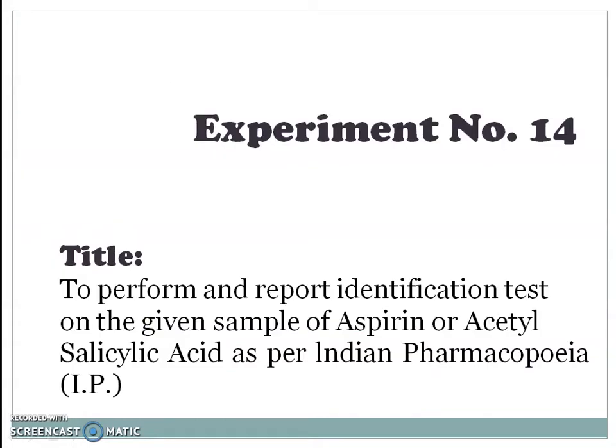Today we are going to deal with experiment number 14. Title of experiment: to perform and report identification test on given sample of aspirin or acetyl salicylic acid as per Indian Pharmacopoeia.